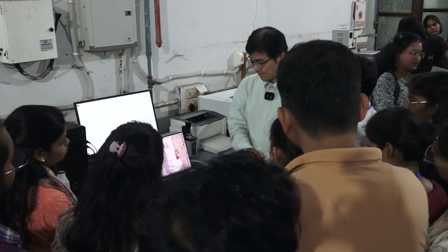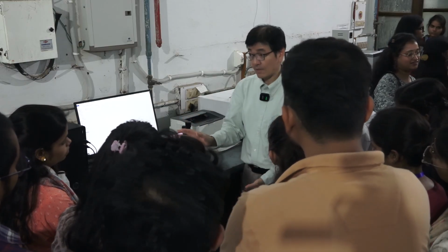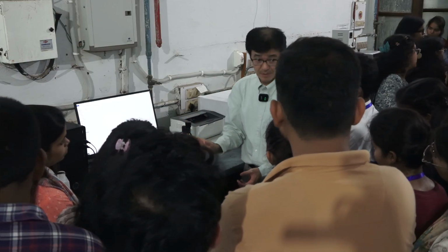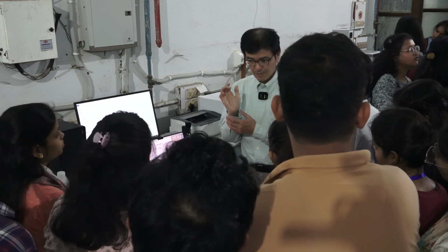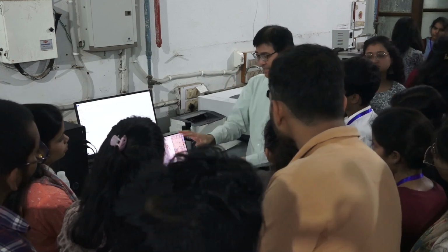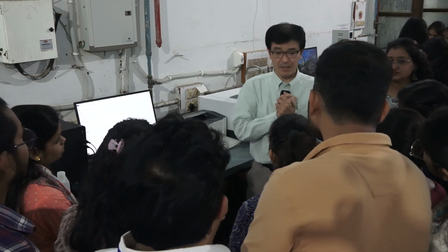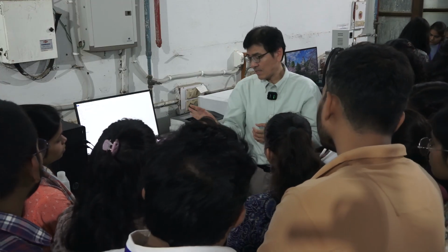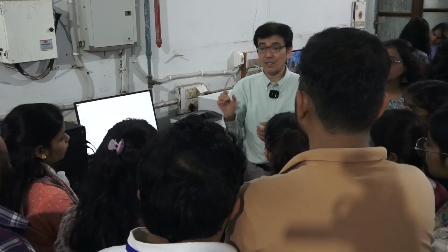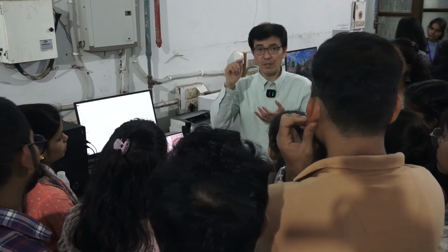And so, when we want to know what is the real exact assignment, one method is to check the literature. Okay, this is not a new compound, so someone must already study peak assignment. Next, if this is a new compound, please consider to introduce stable isotope. Okay, then carbon-13 or deuterium.